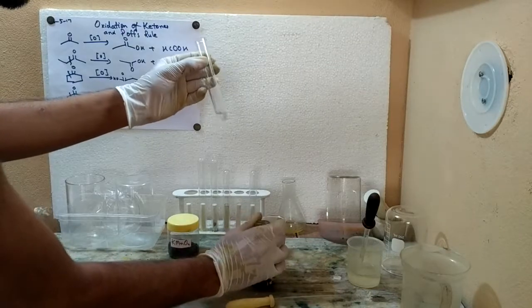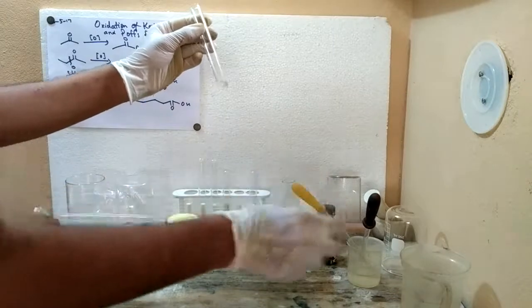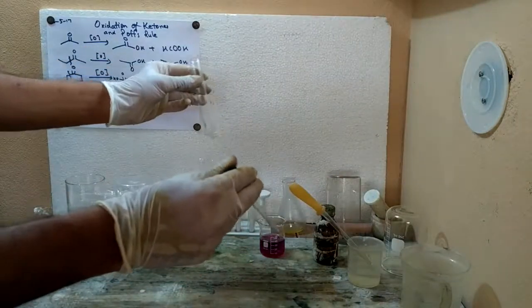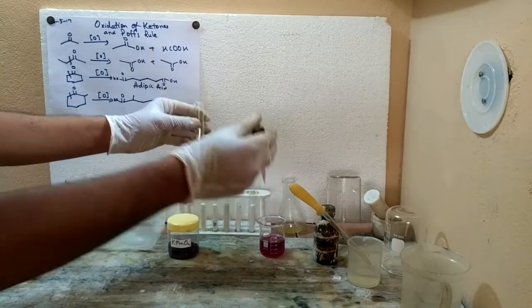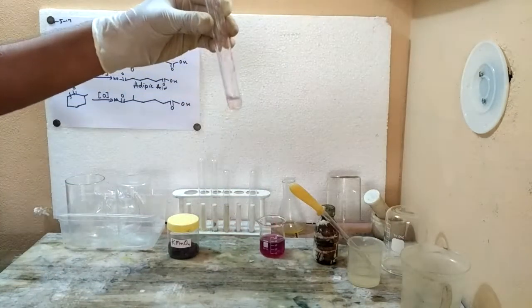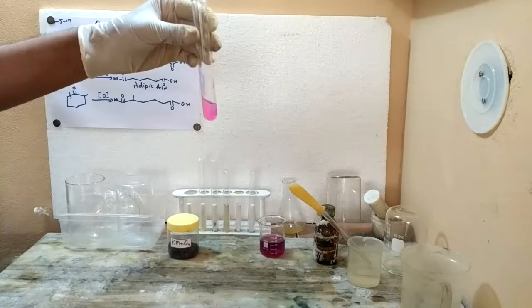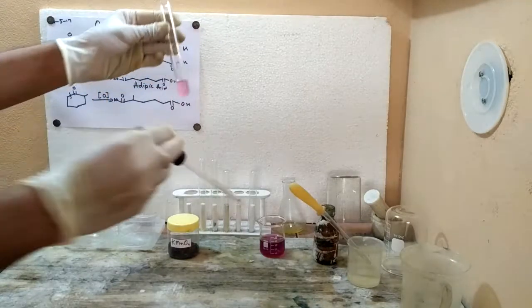Then just give the test tube a shake and add some potassium permanganate to it. Shake the test tube.